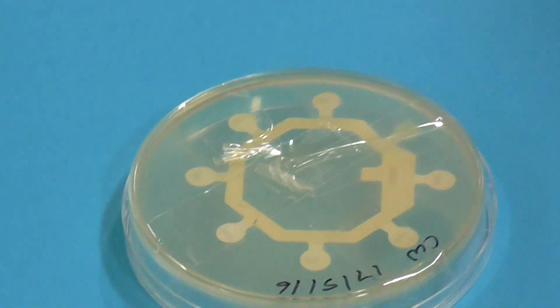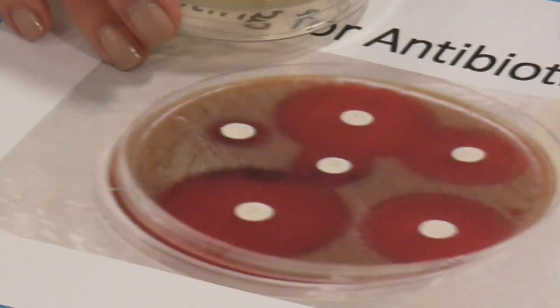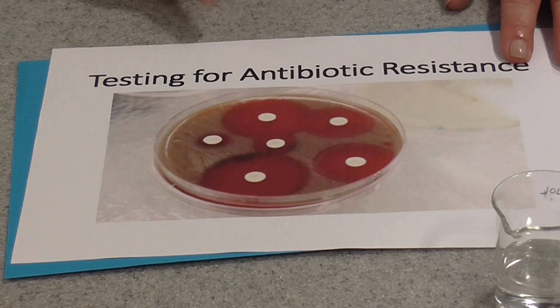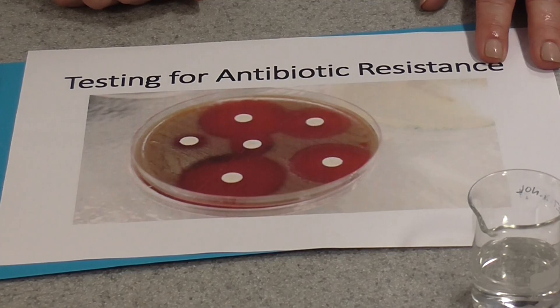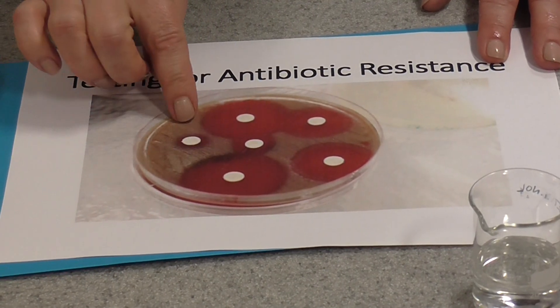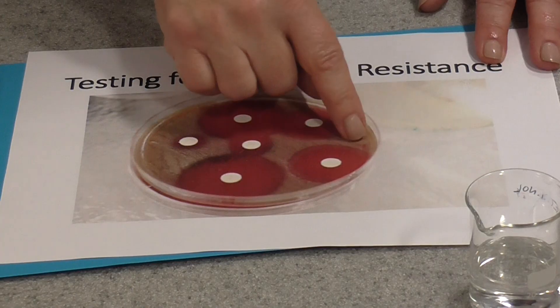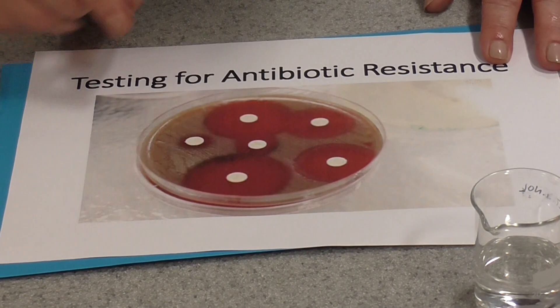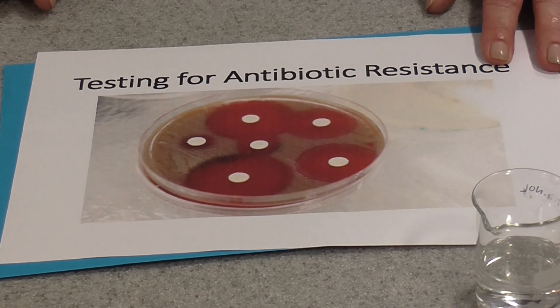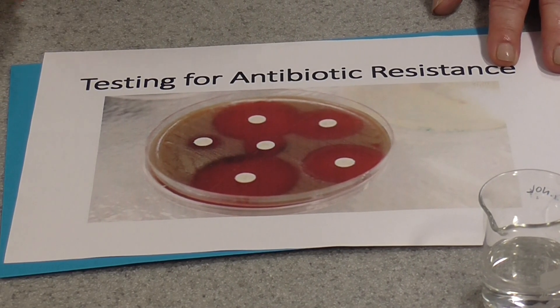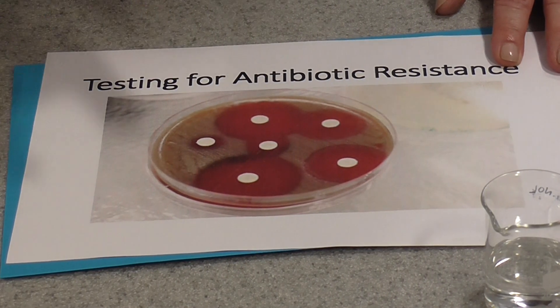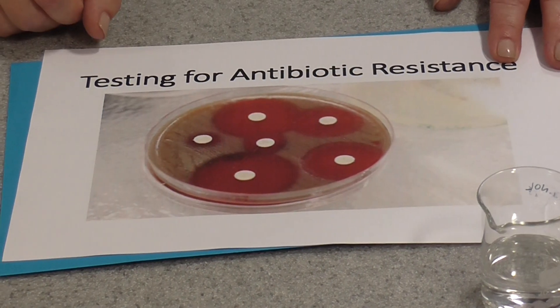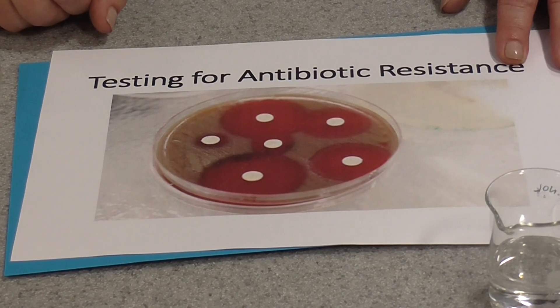You can see that much more clearly on the photograph I started with, which is from, this looks like more of a professional microbiology lab. This is what's called blood agar. It's designed to grow human pathogens. You can see here where the bacteria have formed a lawn. That's the creamy areas. And you can see the antibiotic discs and the zones of clearing around them where the antibiotic has diffused into the agar and inhibited the growth of bacteria or even killed the bacteria. Pretty obviously, by measuring the diameter of the zones of clearing, we can work out which antibiotic is the most effective at preventing the growth of this bacteria.